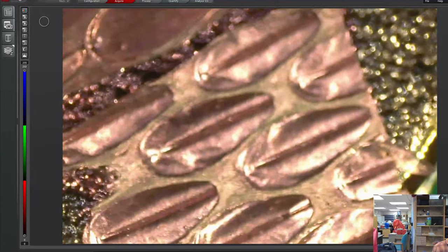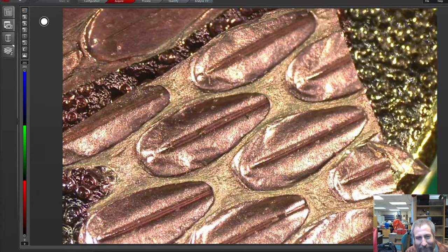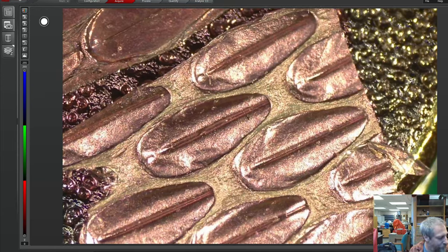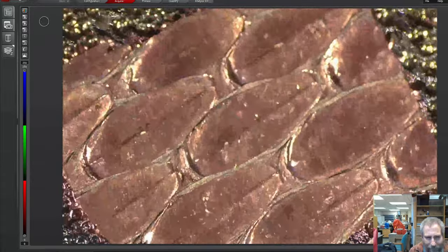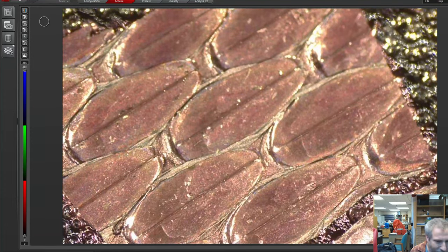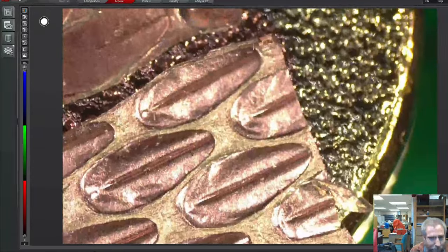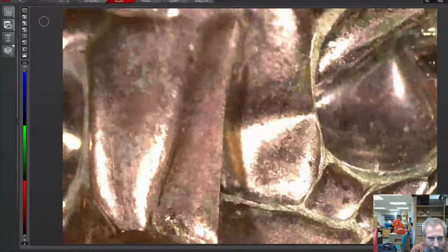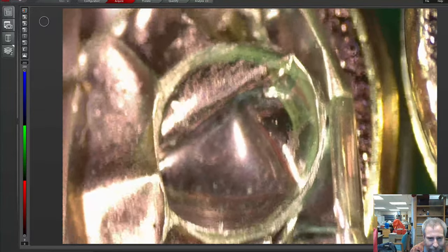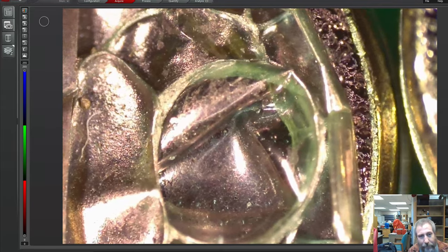So we still have those pieces of snake skin. This was the gold sputter coated snake skin from the snake that molted, and then this was the inside view, and this was the outside view, I believe, of that same specimen. Pacific very carefully rearranged these to have an inside and outside view visible. And then we also looked at the molt of the snake's head with its eye right there. So another piece of the snake skin that we looked at under the scanning electron microscope in an earlier stream.